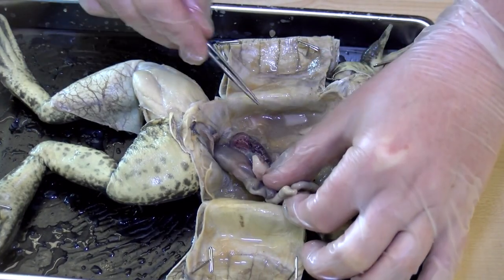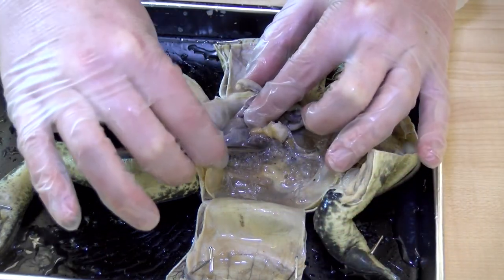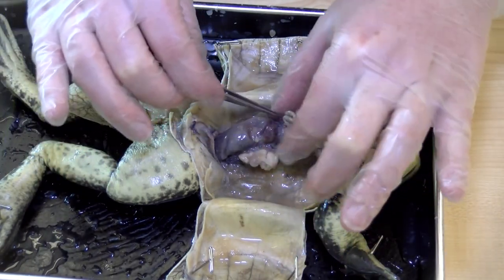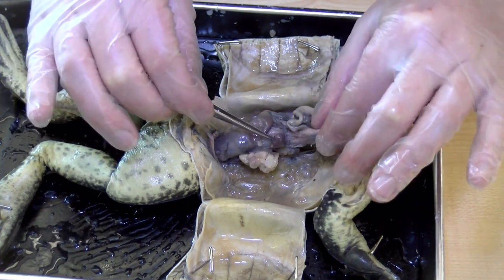At the back here, we can see one of the kidneys, and then on the opposite side there's another kidney tucked in. Underneath, with the intestines kind of tucked in behind, there's a gallbladder — it's kind of like a little raisin, right here.